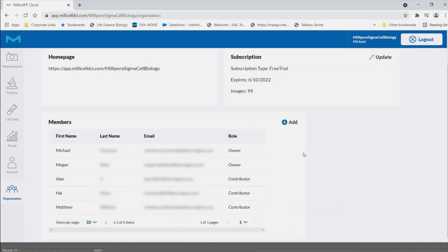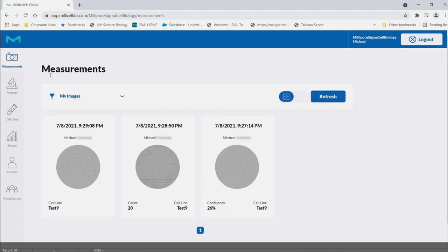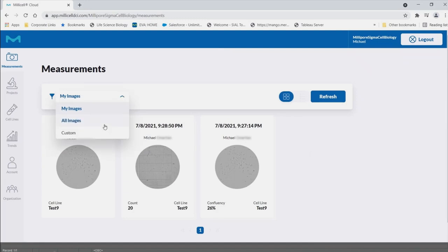Once logged in, you will be redirected to your organization homepage where you can view images, organize cell line and projects, and manage your personal and account information.